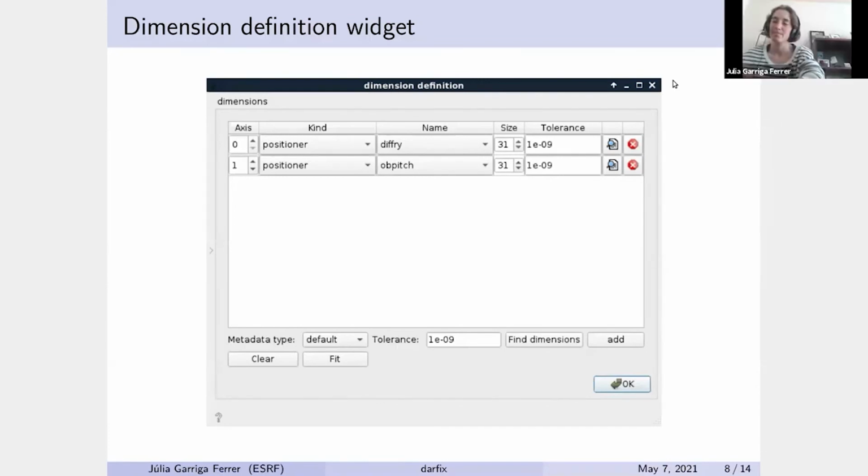So then our final question comes from Inokenti. It's not exactly on data analysis, but still relevant. Would the increased coherence of the new source improve your results, or is it limited by the lens performance? And what about plastic lenses with no grain boundaries inside?